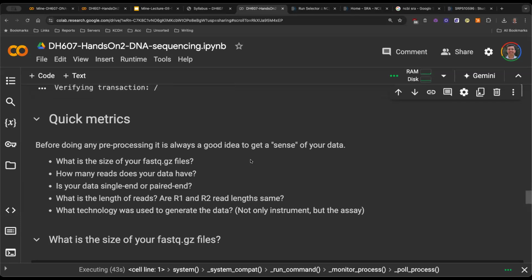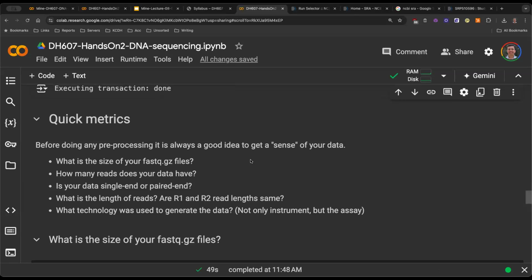Don't let the machine figure out things for you. You can be a bit smarter and actually help the machine. Keep an eye open on what exactly you're looking at. The machine will eventually figure these things out, but if you help it, you'll move quicker. Okay, that's just a side note.